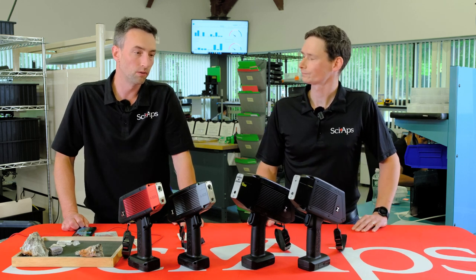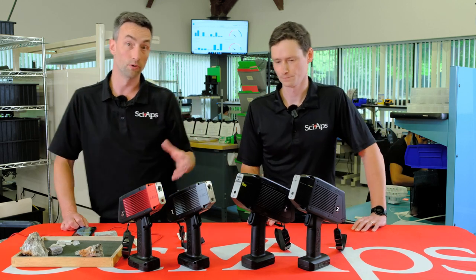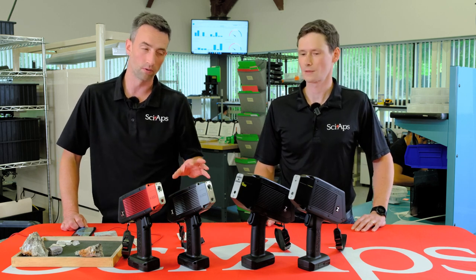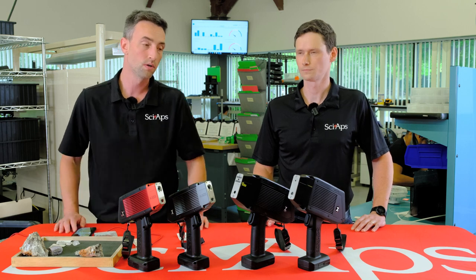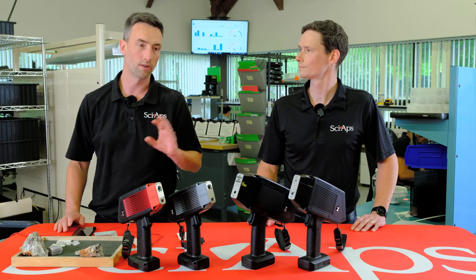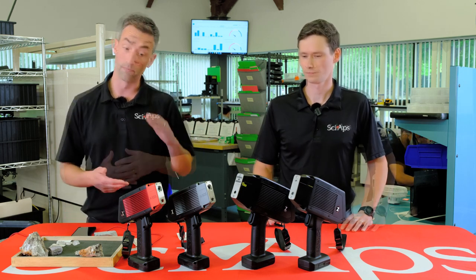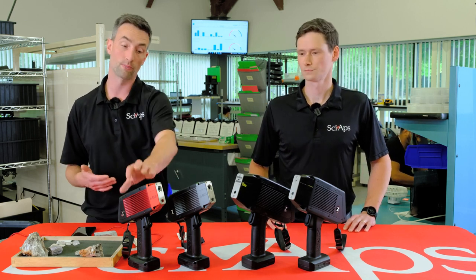Yeah, for LIBS, a lot of the users are lithium explorers and producers. With LIBS, you get about a 3 to 5 ppm detection limit in general, and lithium just fortunately happens to be one of the best elements in terms of sensitivity on LIBS. One of the big markets recently has been rare earth elements.